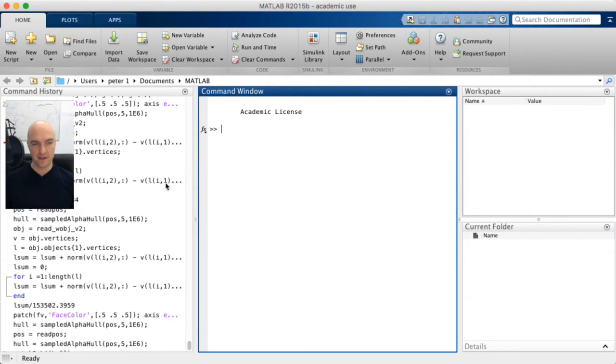On the left side, you will see the command history. If I'm going a bit quick and you lose track on the command line side, you can also see a bit of the history there. Then on the right side, we've got the workspace, which is where we're going to see the variables. For most of the variables, we're going to try to stay consistent with the naming so we're not going to have too many issues remembering which variable is called what. I'll go through that in a minute when we start loading atom probe data.